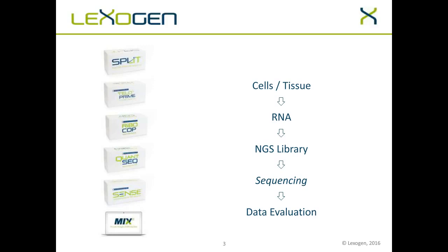Now, at Lexogen, we have developed a lot of kits for all kinds of applications along this workflow, starting from the RNA extraction to library preparation up to bioinformatics solutions. But I will not be talking about these today. If you're interested in them, you're welcome to visit lexogen.com. But today I will be talking about something that encompasses the whole workflow, and these are the spike-in controls.